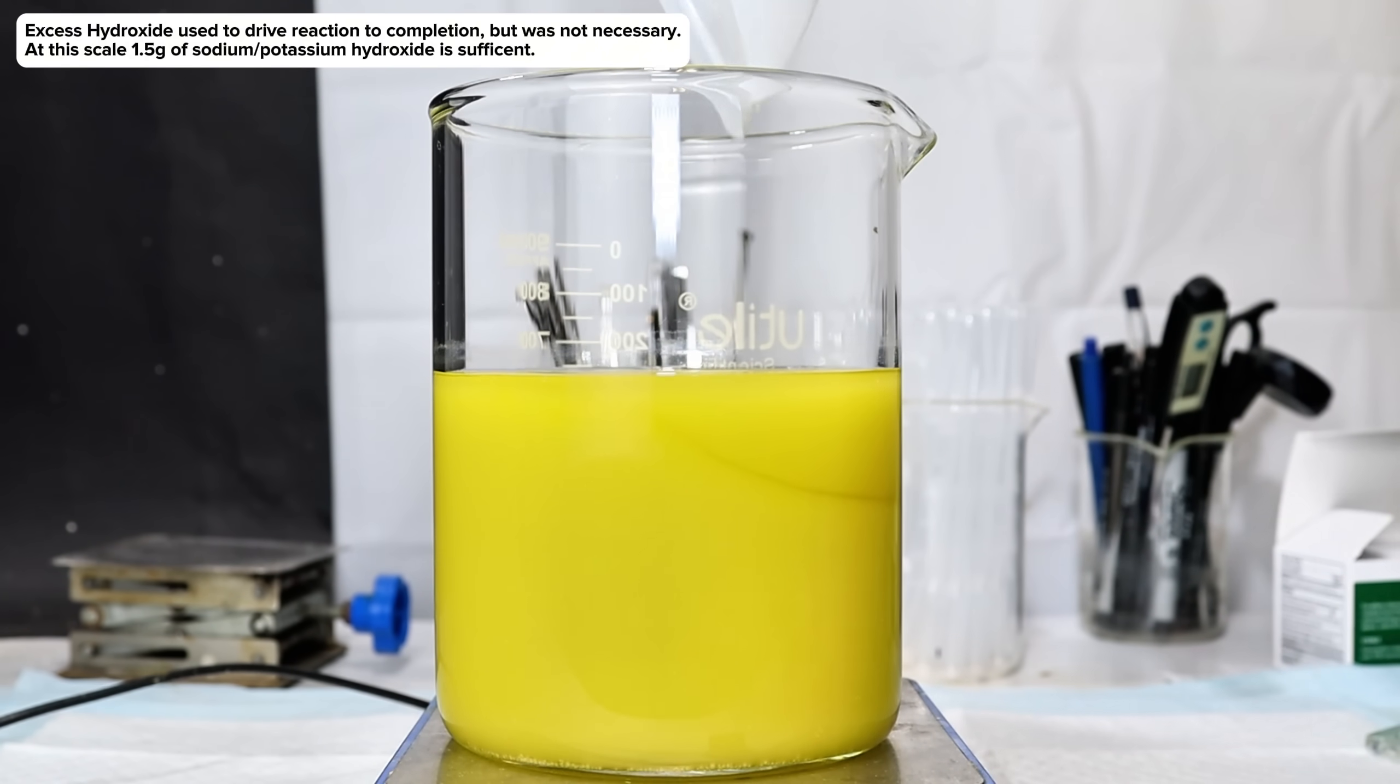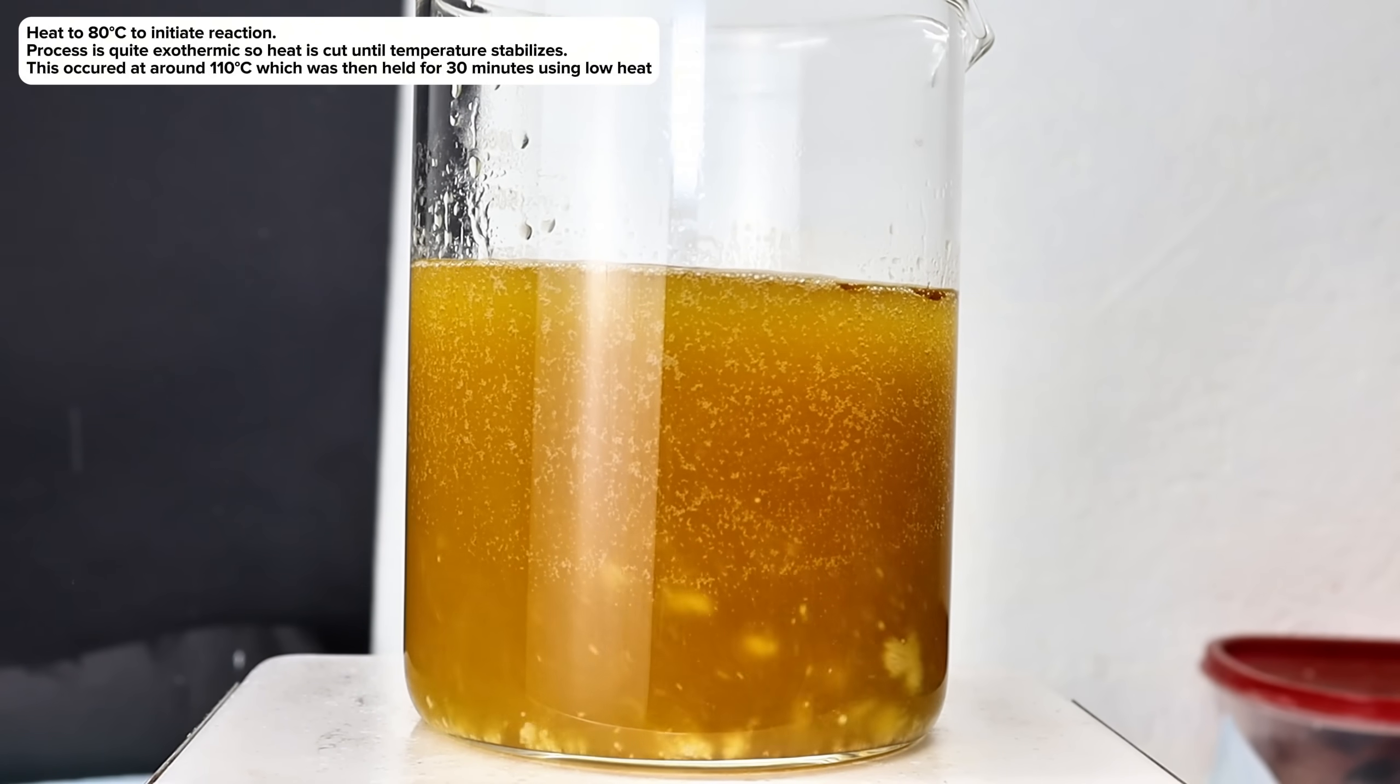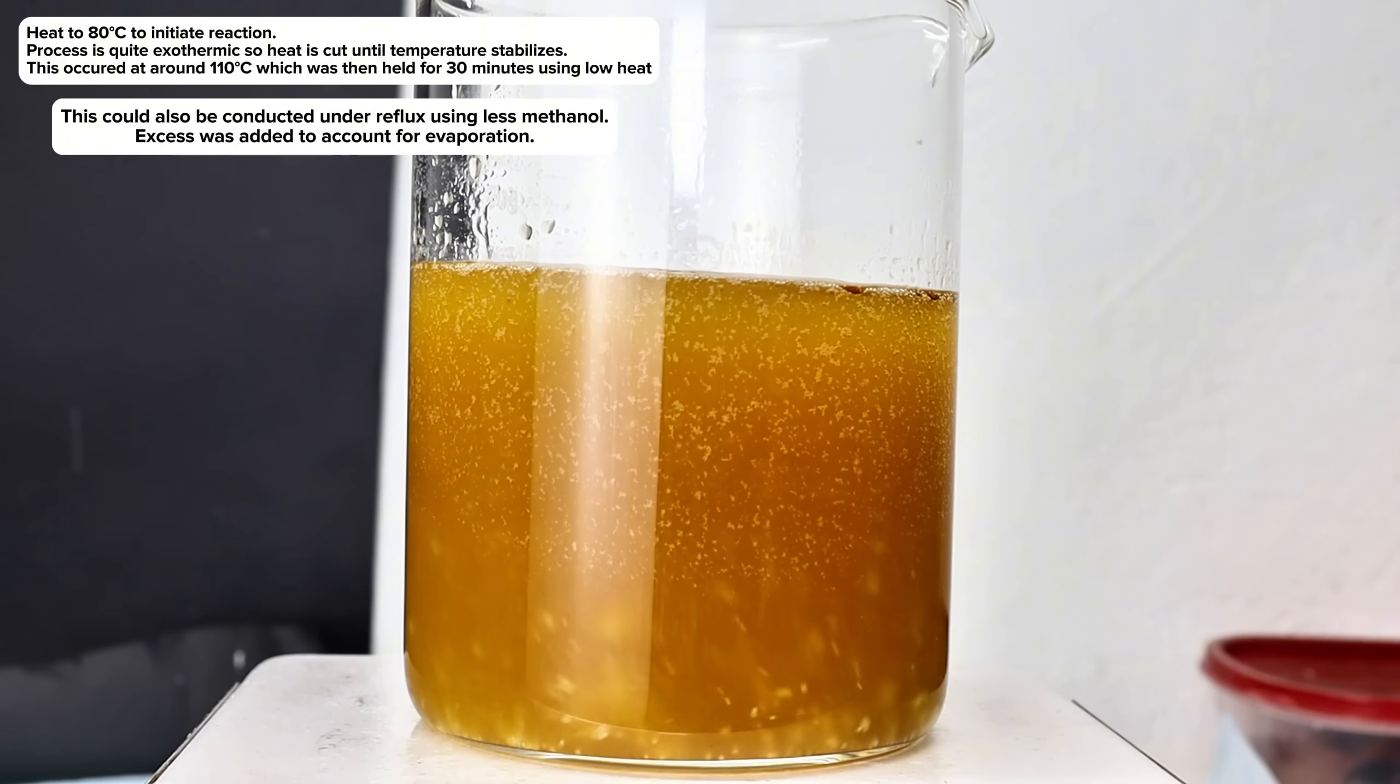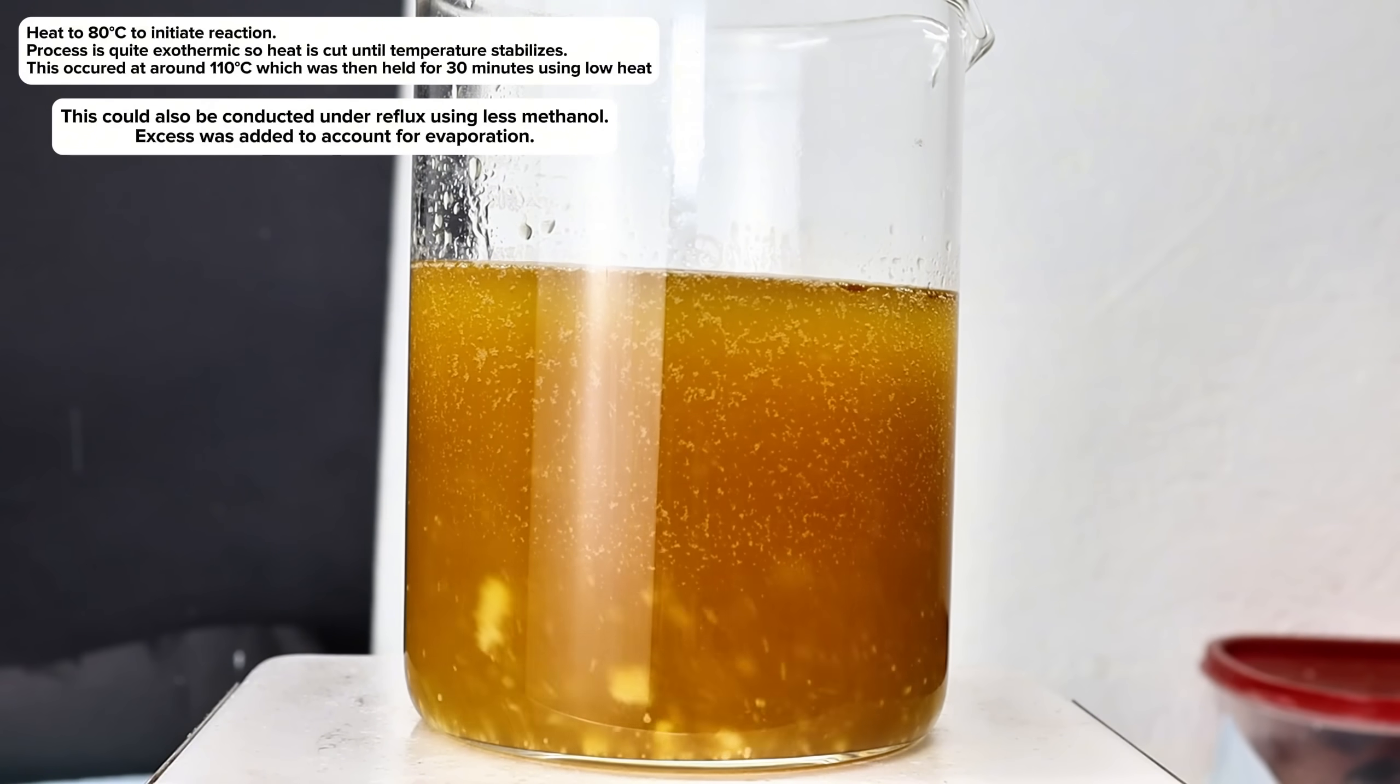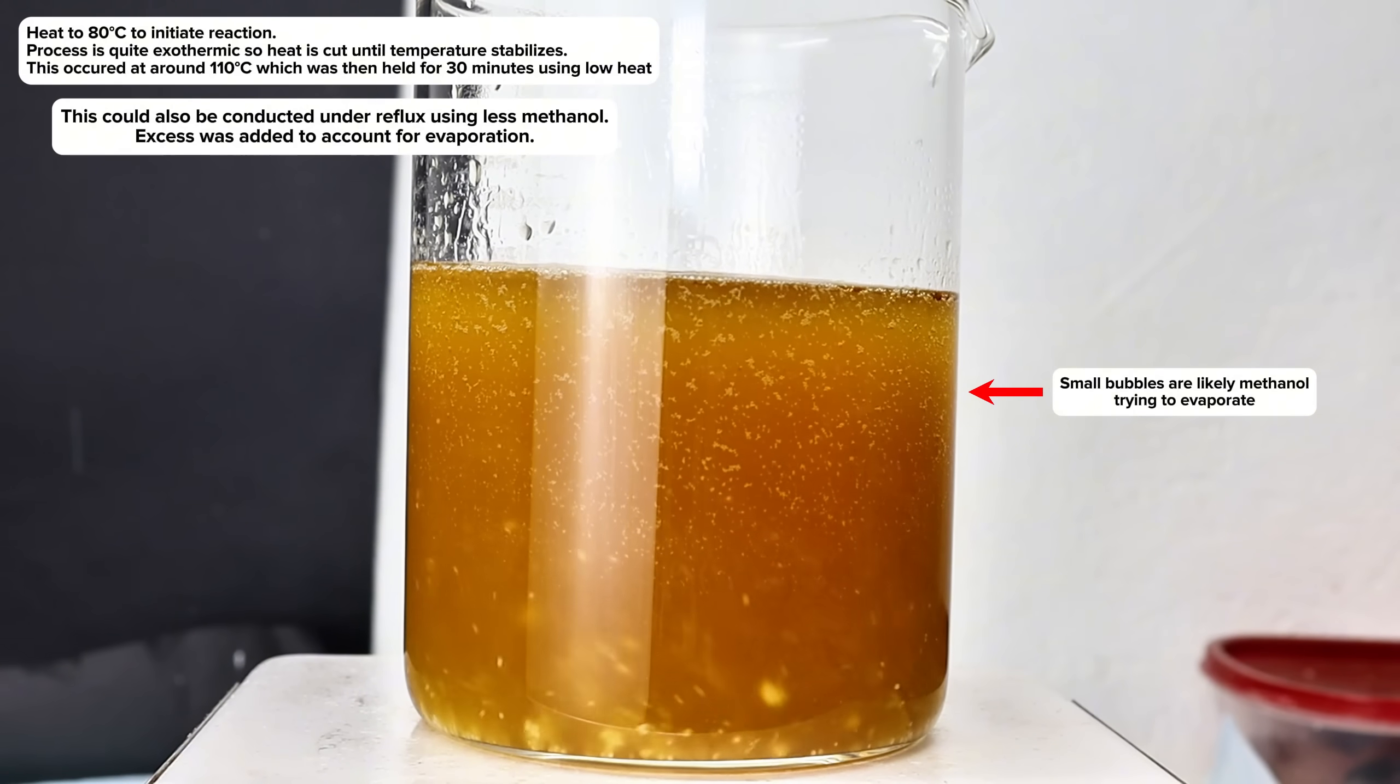The beaker was then transferred to my hot plate and heated to around 80 degrees Celsius, at which point the reaction became exothermic and heating was cut. At around 110 degrees Celsius, the temperature stopped climbing, and so at that point heat was applied for the remainder of the reaction to maintain that temperature.